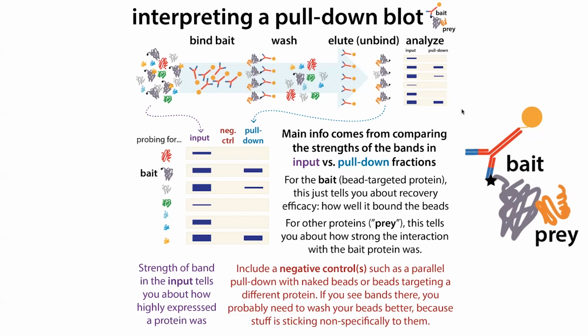Another caveat to keep in mind is that sometimes the interactions that you see might not be physiologically relevant. They may not be things that are naturally happening. Typically in these experiments, you're dealing with some sort of cell lysate. So basically you break open the cells and then you bind things. And once you've broken open the cells, the conditions are going to be different from the conditions inside of cells.